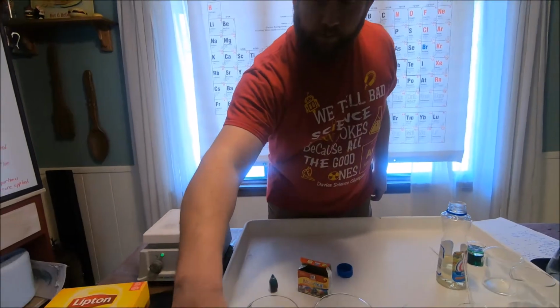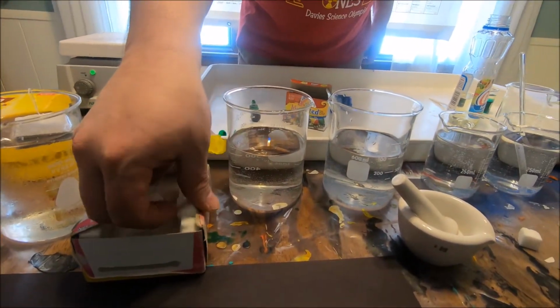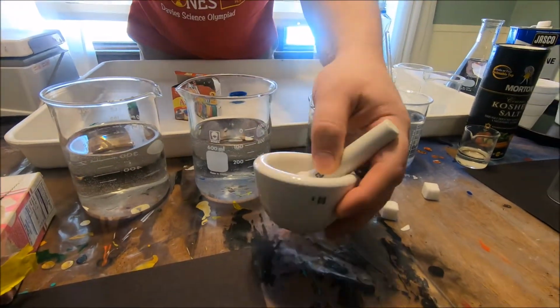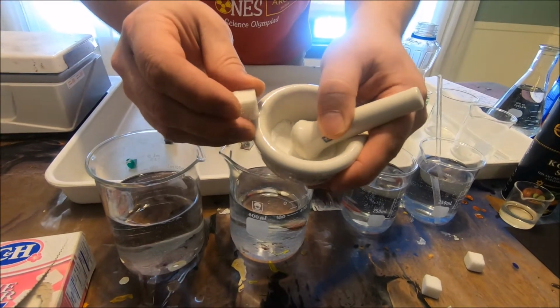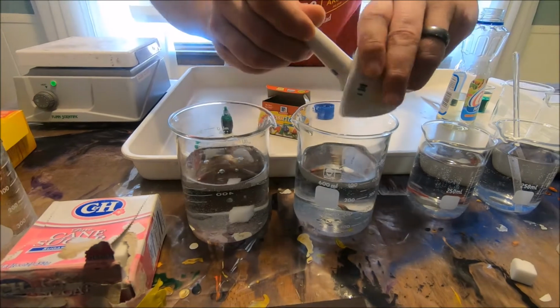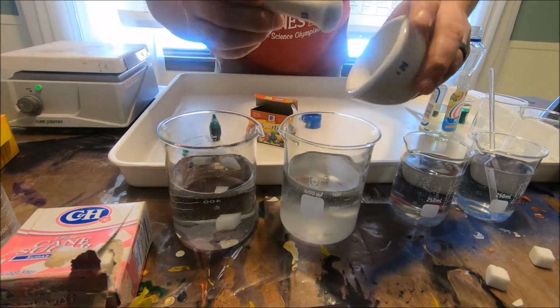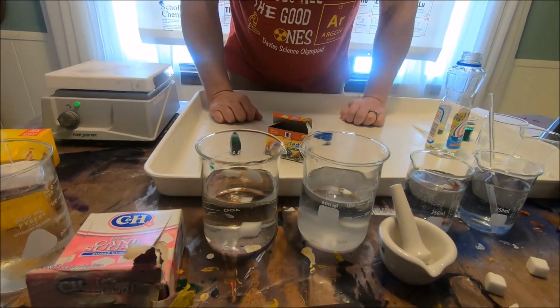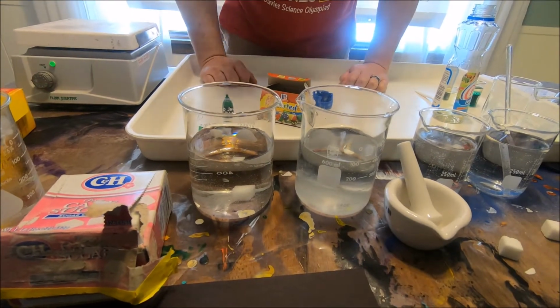The second one, we've got our sugar cube. They're old, so we're not going to eat any of them. And I've got a second sugar cube. I've already used the mortar and pestle to crush the cube into smaller pieces. What we're going to do is just drop the cube into one, and we're going to drop another one in, and we're just going to let them sit there, and as they sit, we're going to see how that rate of dissolving changes.